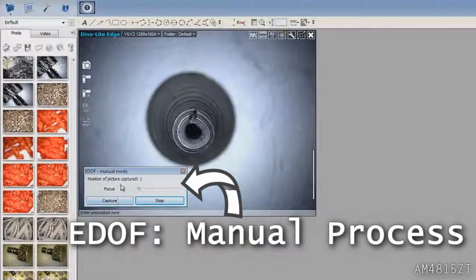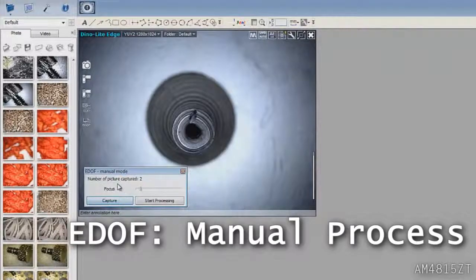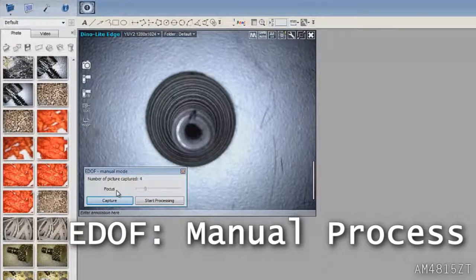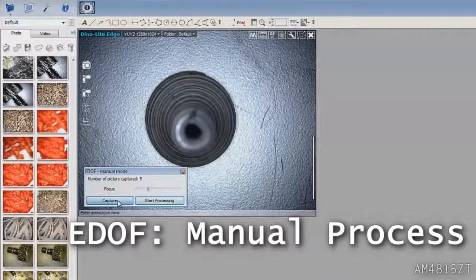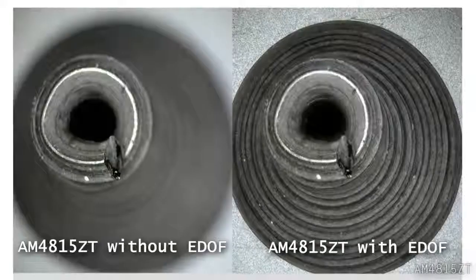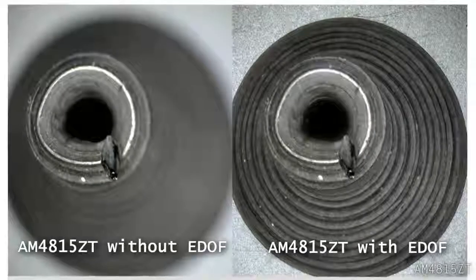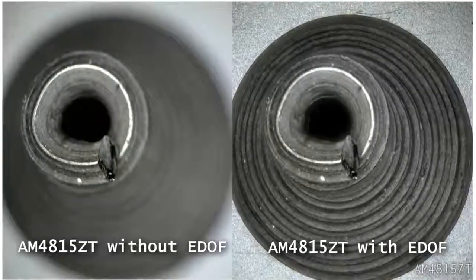The EDOF manual process allows a user to manually capture the image simply by using the keyboard or mouse and capturing the desired points.